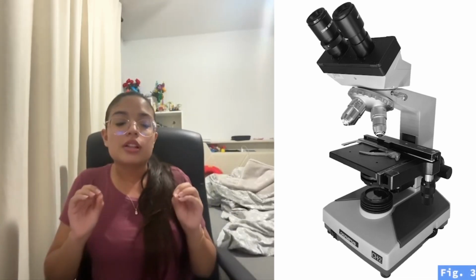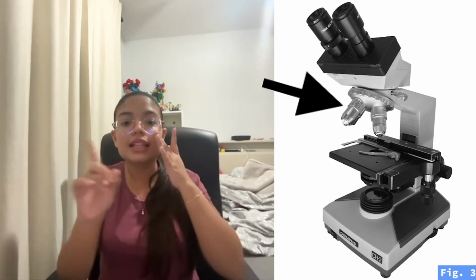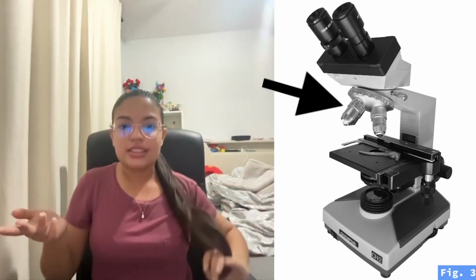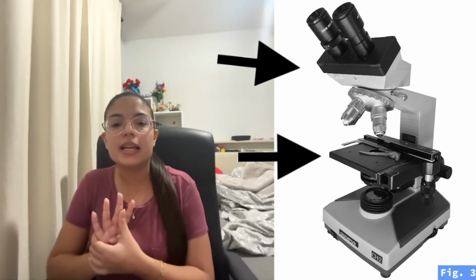Compound microscopes are a specific type that magnify the thing that is being viewed through lenses. This is where it gets its name from, the compounded lenses that it has that actually do the magnification, as I said. And then, generally speaking, this microscope has 4 parts: a head, a stage, a base, and an arm.